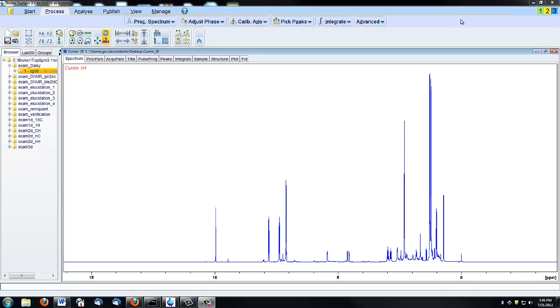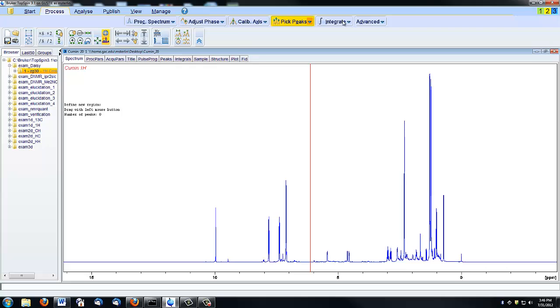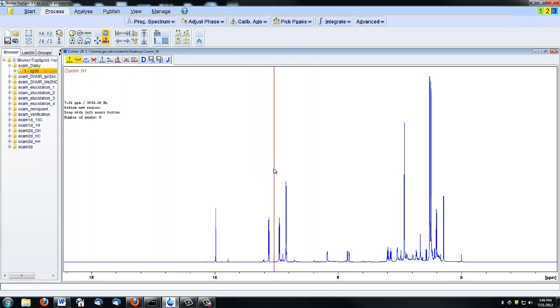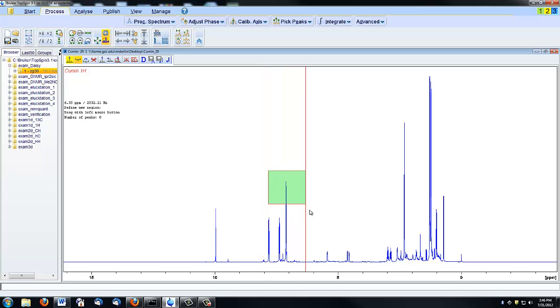This video will demonstrate the peak picking capabilities of Topspin. To begin, click the Pick Peaks tab. You can manually define regions that you wish to have peaks picked by boxing them in.